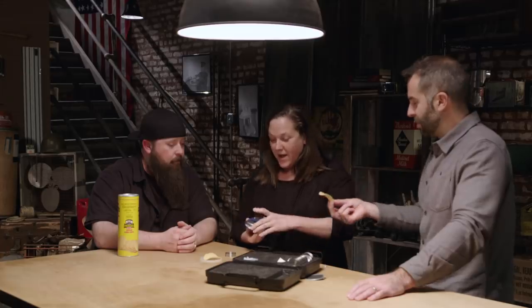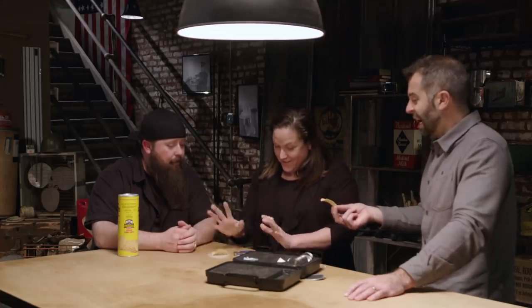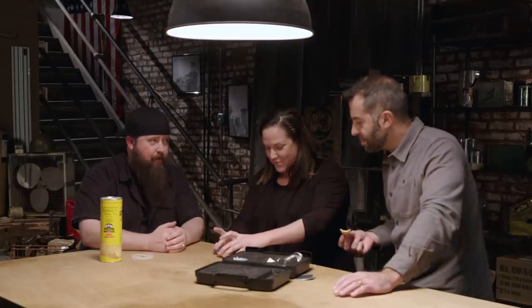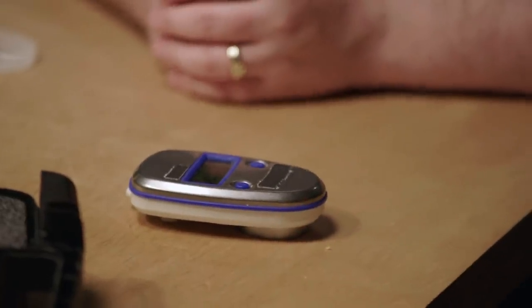Or it can support the growth of yeast or mold. Unfortunately, I'm going to have to crumble it slightly. I'm just going to put my water activity meter unit on top. As of right now it's about 0.27.